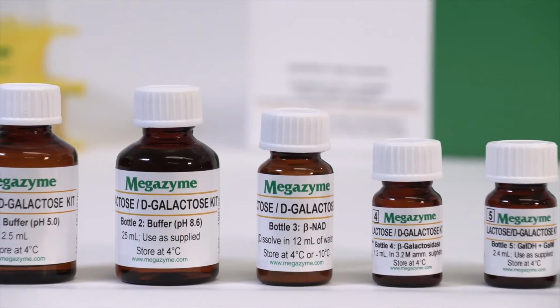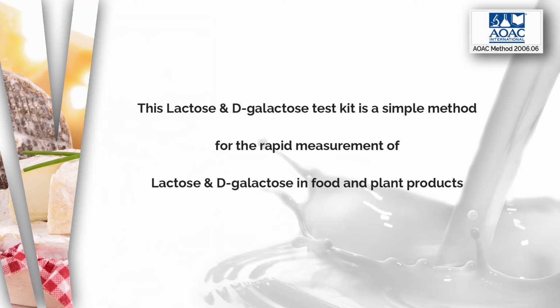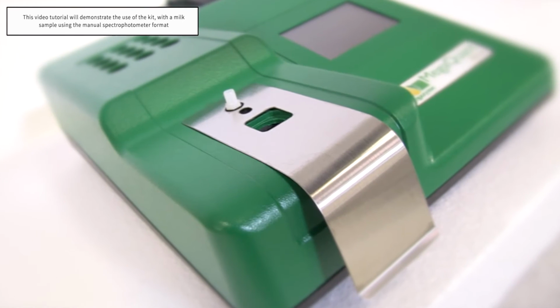This lactose and D-galactose test kit, K-LACGAR, is a simple method which allows for the rapid measurement of lactose and D-galactose in food and plant products, and was adopted as an AOAC official method in 2006, AOAC 2006.06. This video tutorial will demonstrate the use of the kit with a milk sample, using the manual spectrophotometer format.